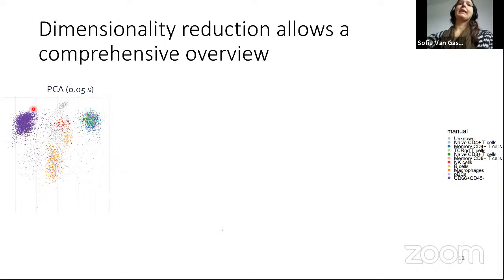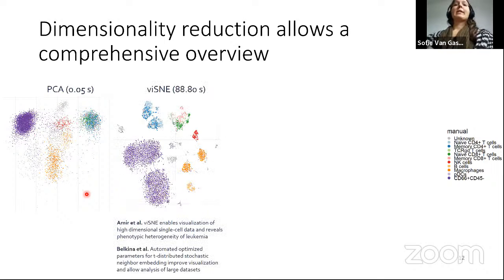And then a PCA separation won't split them up very well. So therefore, PCA is actually not that suited for cytometry data. What's typically used is t-SNE or v-SNE. And here you can see that all the islands are separating much better. That's because it takes a more local approach, so it will only try to keep the nearest neighbors close to a cell.